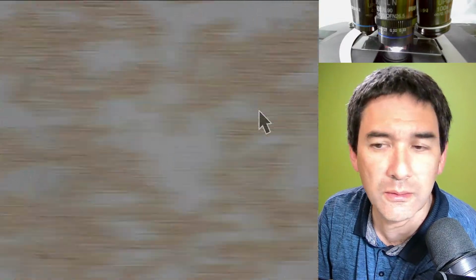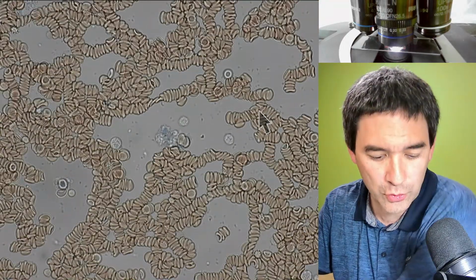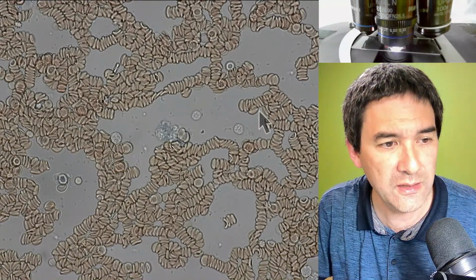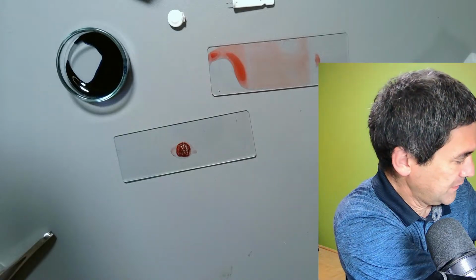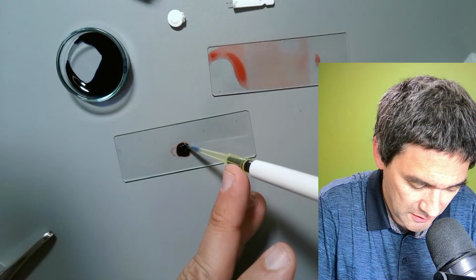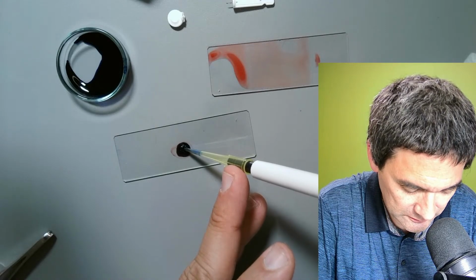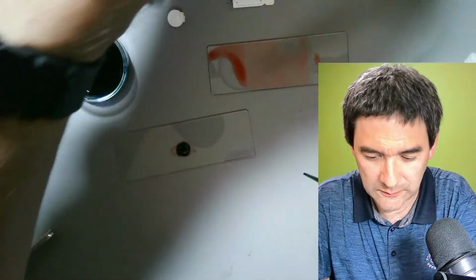Okay, I think this kind of explains a little bit. You know what? I'm going to try it in any case. I'm going to try to add a little bit more of the stain, and maybe this does make a difference.